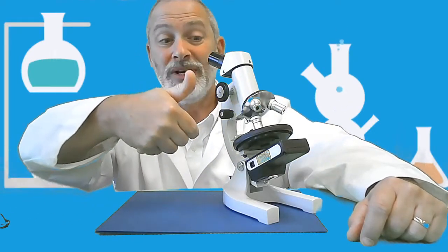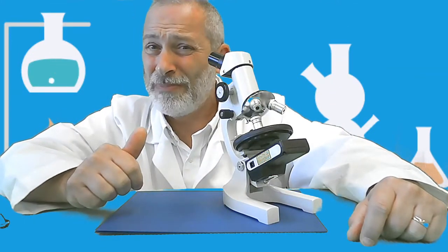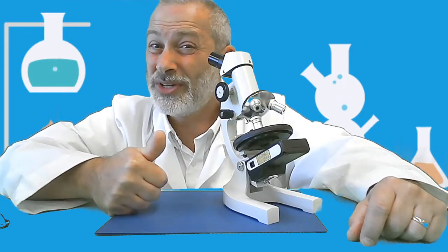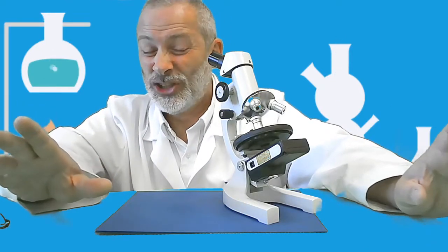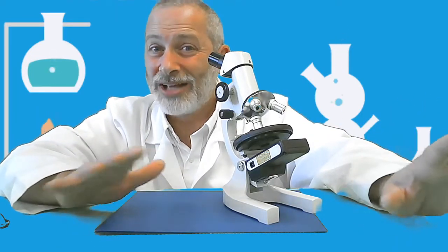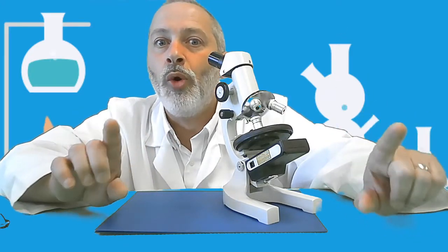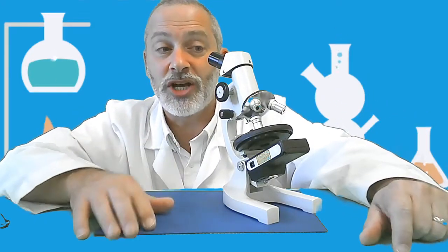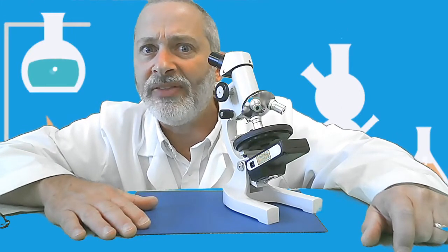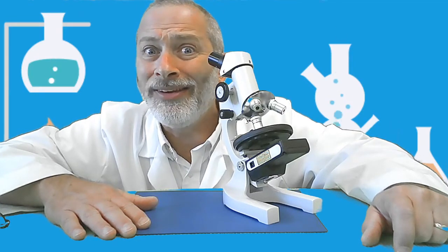But if you cranked up on the coarse adjustment knob and turned the high power over and then tried to use the coarse adjustment knob to get into focus again, smash, crack, shatter. Your glass would break. It's super close, yes, but you only need to use the fine adjustment knob. So when I look in, oh my goodness, it's pretty dark in there. How do you think we could brighten things up?